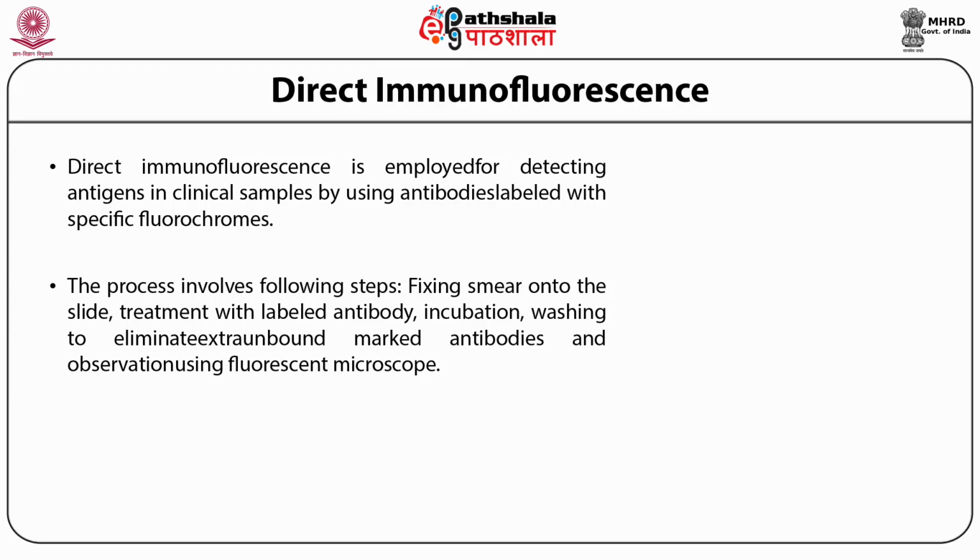Then, the treatment with labeled antibody, followed by the incubation, then the washing to eliminate extra unbound marked antibodies, and finally the observation using a fluorescent microscope.